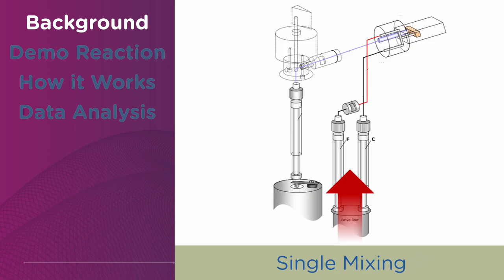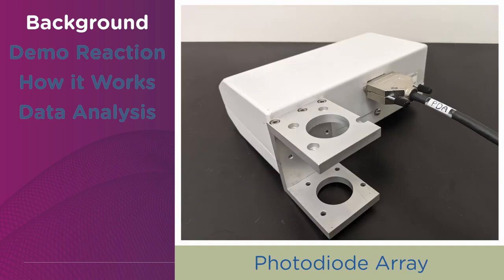For this demonstration, we will use the SX-20 in a single mixing configuration along with a photodiode array accessory.